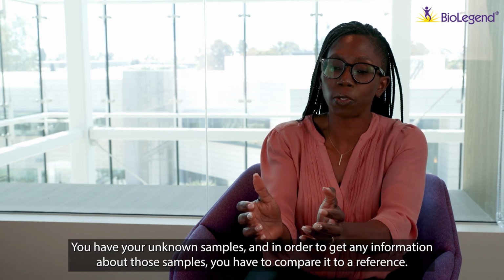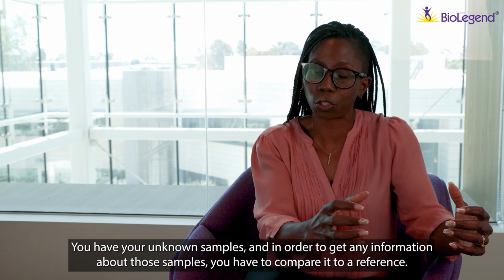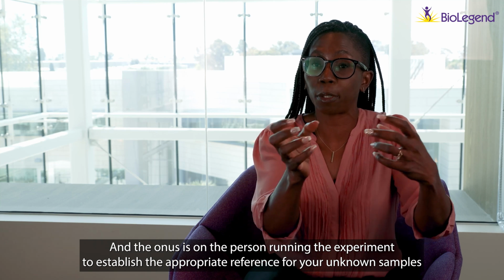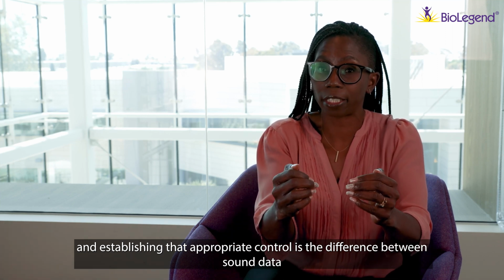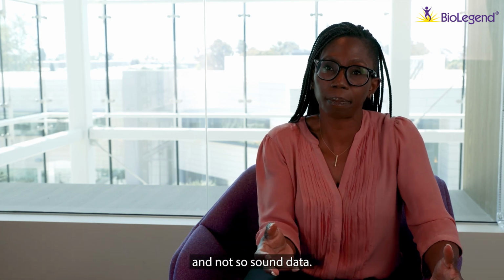You have your unknown samples, and in order to get any information about those samples, you have to compare it to a reference. And the onus is on the person running the experiment to establish the appropriate reference for your unknown samples. And establishing that appropriate control is the difference between sound data and not so sound data.